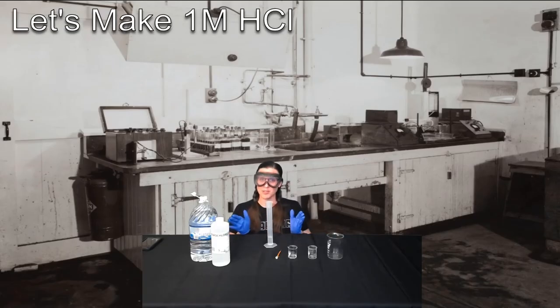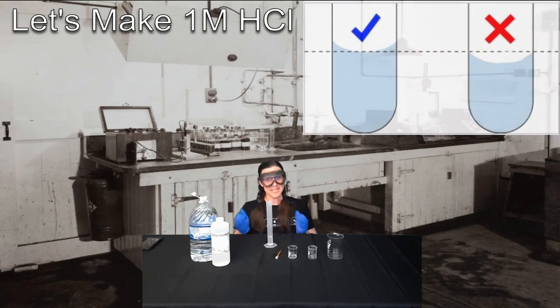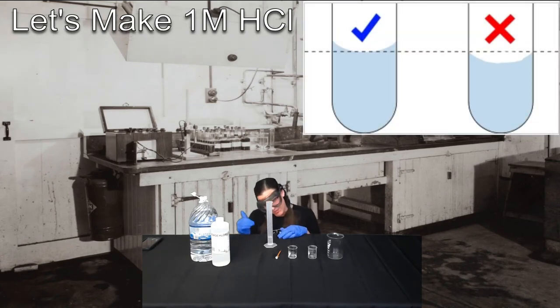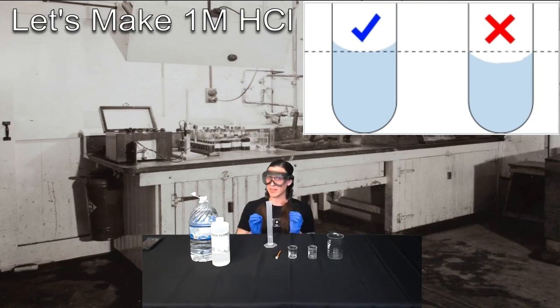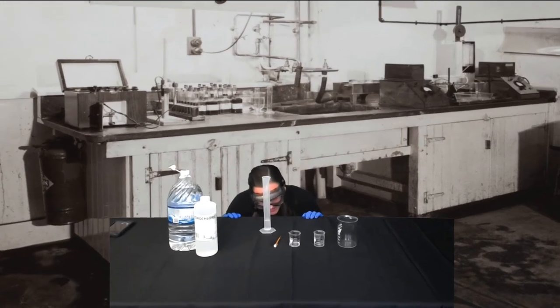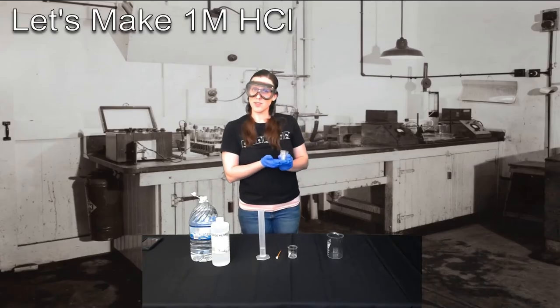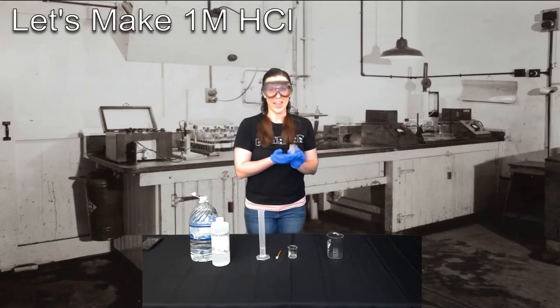And of course, anytime you're measuring volumes, you need to measure from the meniscus. So get down at eye level with the bottom of the bubble created by the water's adhesive properties, to the sides of your cylinder or container. Looks like we've got 18.04 milliliters of di water roughly in our graduated cylinder. Now I also have another beaker here labeled 1 molar HCL.